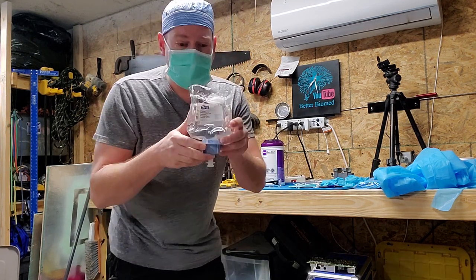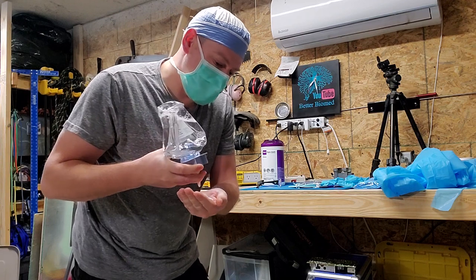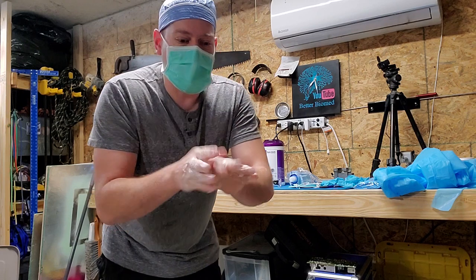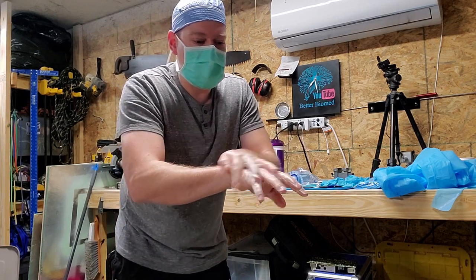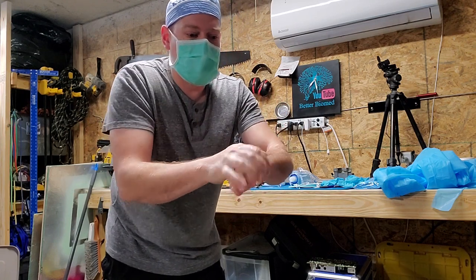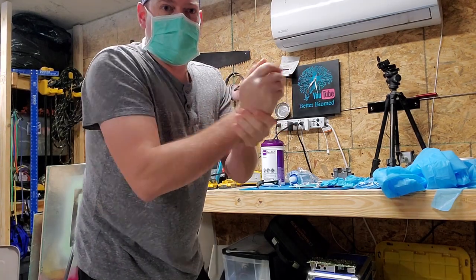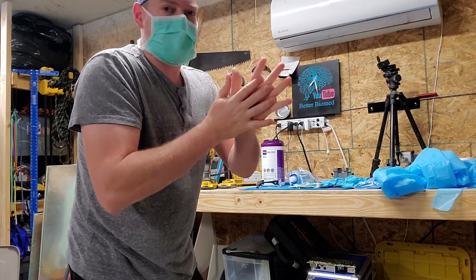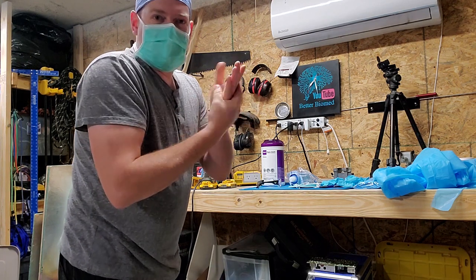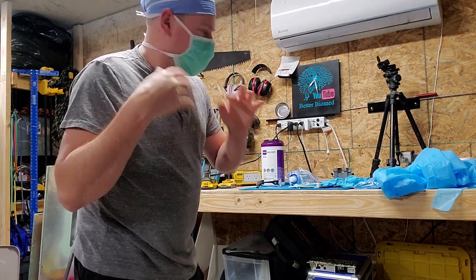The very first thing that you're going to do when you get near a COVID ward is you're going to sanitize your hands, all right? I hope you guys know how to sanitize your hands. Going to start with the palms, move to the backs of the hands, do the fingertips, and keep rubbing until it dries out. You might stand there for 30 seconds, 45 seconds. Got to do this first. So all sorts of stuff that you could have picked up on the way to the patient room. We're just going to make sure that we get it all off our hands and clean.